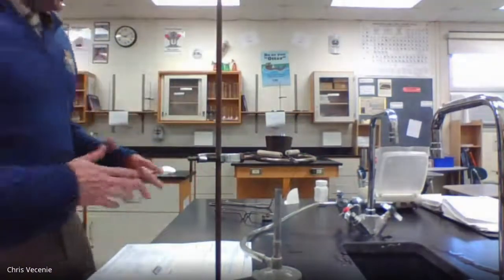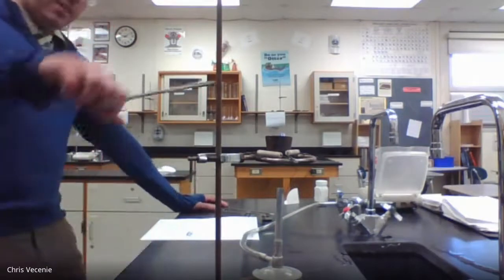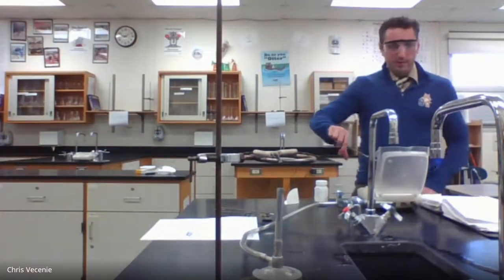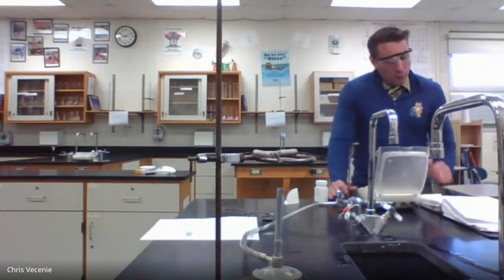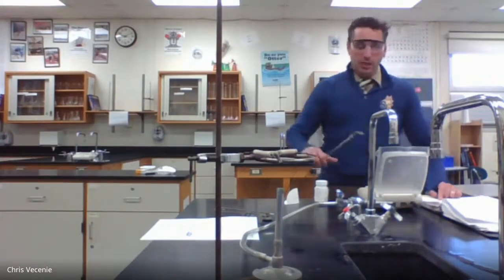This guy's going to be too hot to touch with my hands now, so I'm going to have to grab my crucible tongs. All right, and then step 4 says, using the tongs to handle the crucible, get the mass of the empty crucible. So I'm going to move this guy over, zero out my balance rather, putting it on my balance. Reading that number off, this is what's going in the 4th line down on your data table. All right, so the number we're getting there is 10.73. So 10.73 is the mass of my empty crucible.